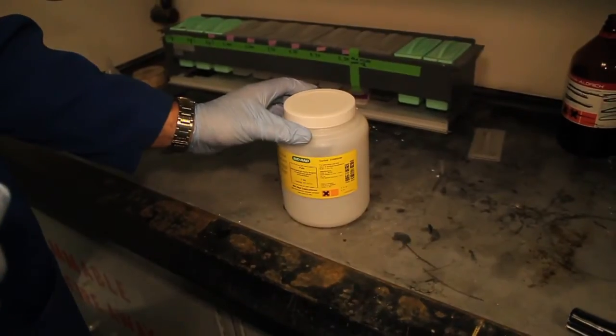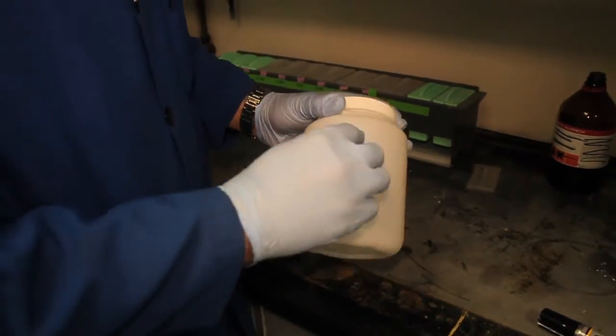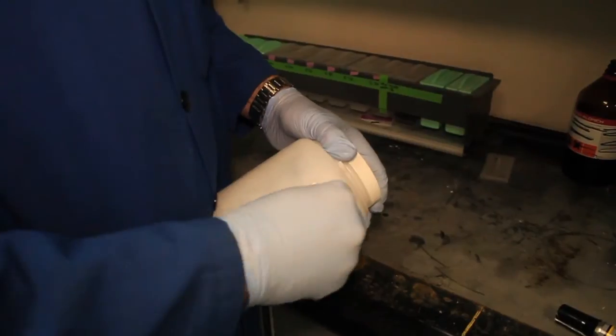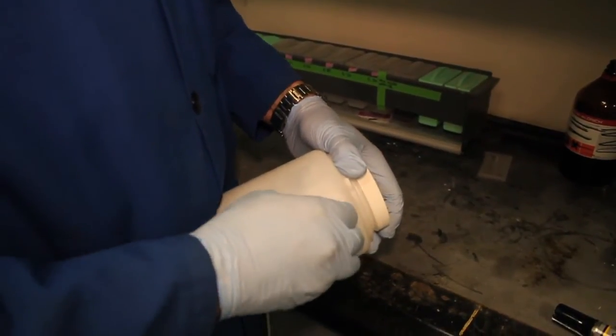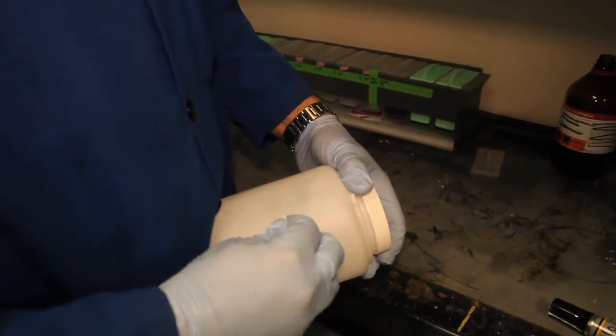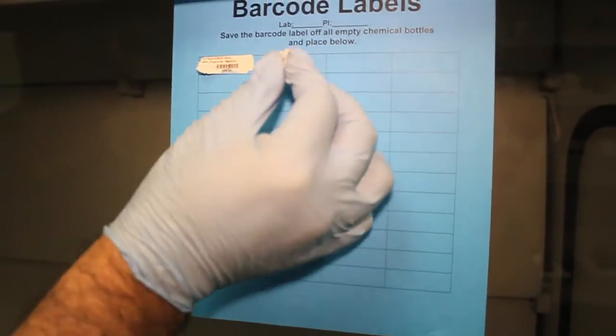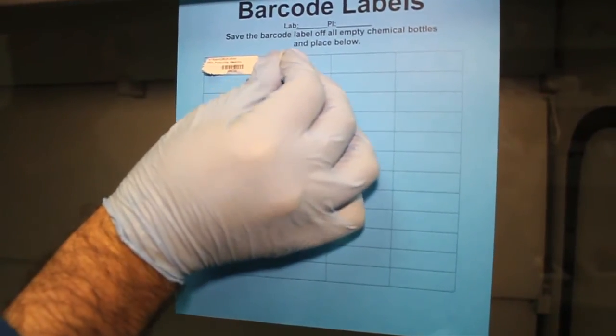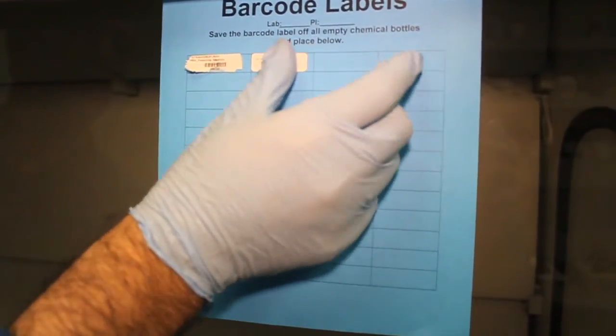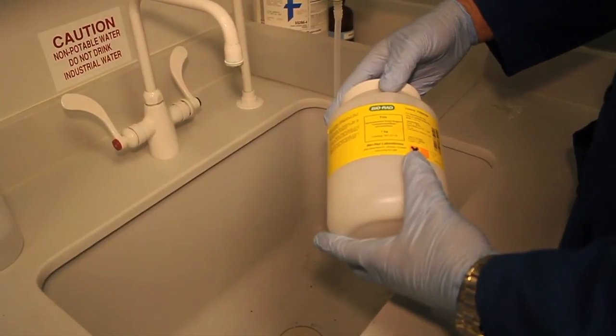The procedure for dry empty chemical bottles is nearly the same. Peel the label and place it onto the barcode sheets provided. Make sure that the chemical is not a water reactive chemical.